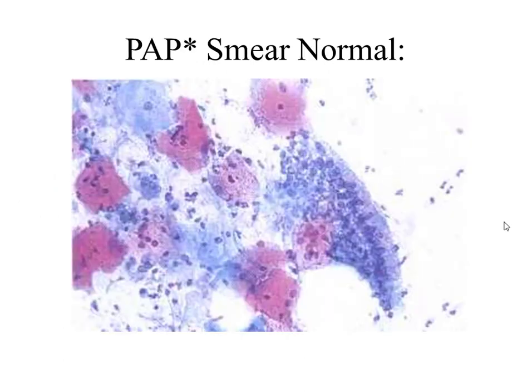Here you can see the typical Pap smears, which is a variant of the most popular diagnostic procedure for cervical cancer. We make smears from the cervix of the uterus, from the ectocervix, and put this smear on the glass for cytological investigation.